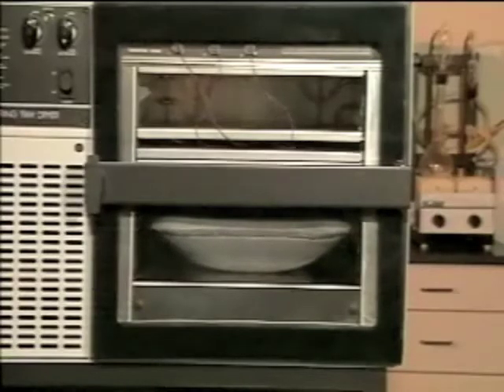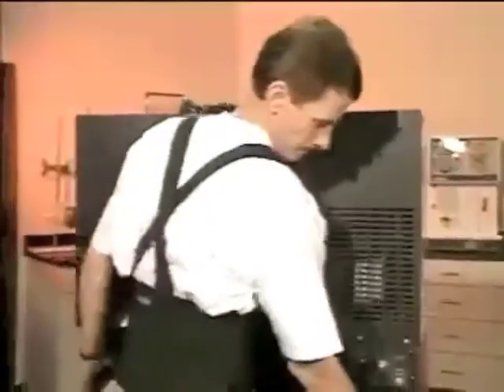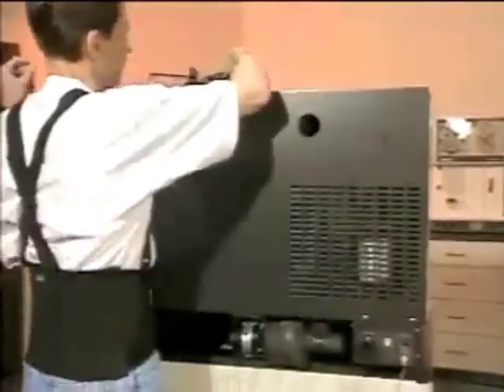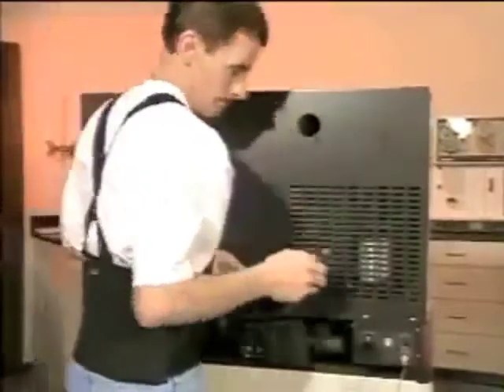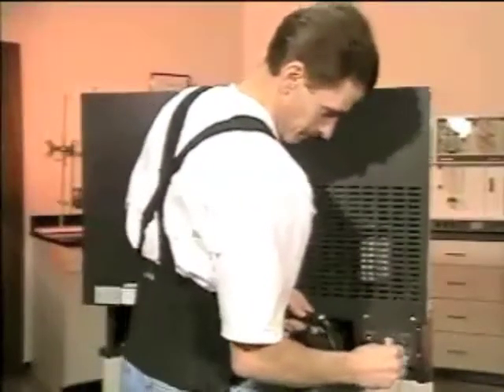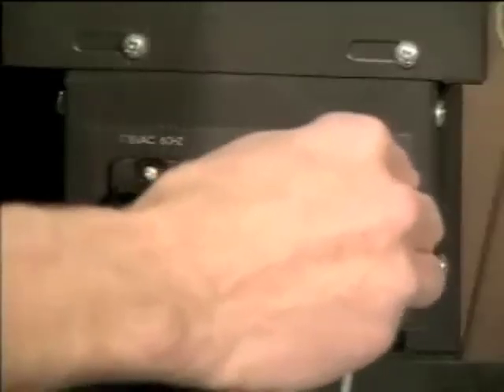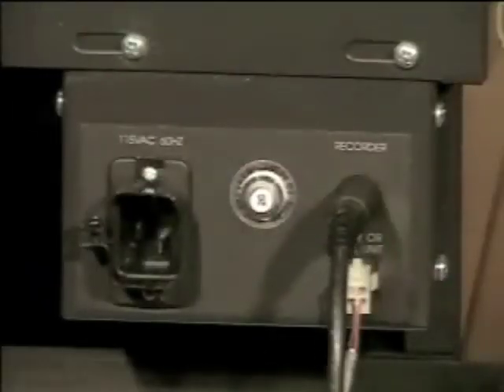On the back of your tray dryer is a port. There's a similar port on the back of the freeze dryer. When connected with the cable provided, the tray dryer can control the freeze dryer's vacuum startup during automatic mode operation. Also on the back is an 8-pin DIN port for connection to a recorder.